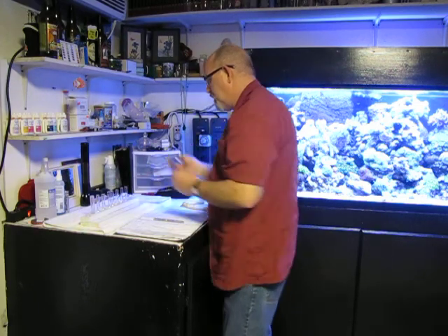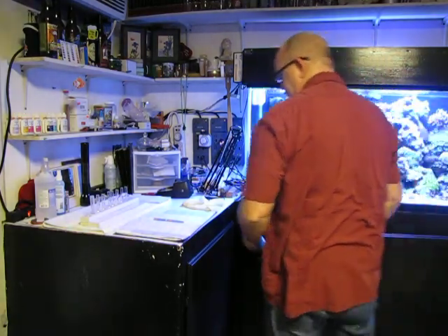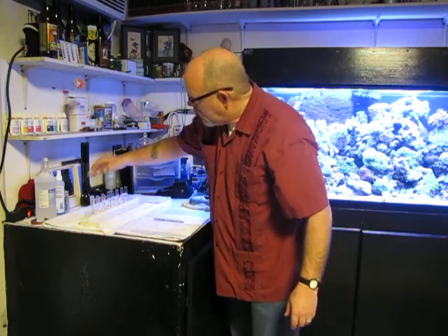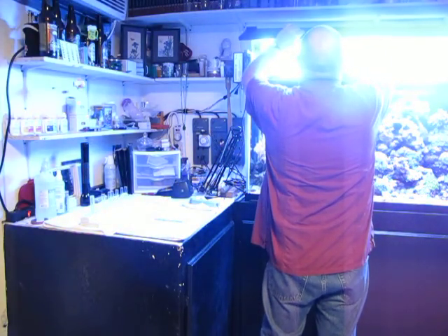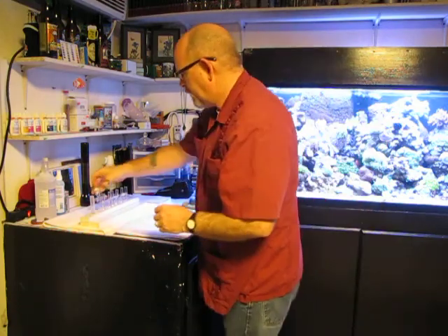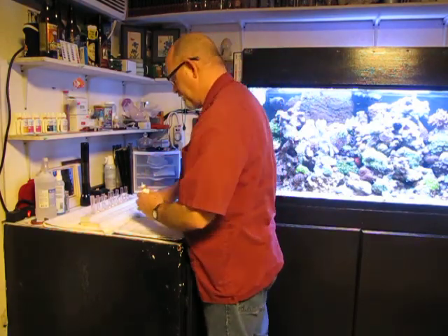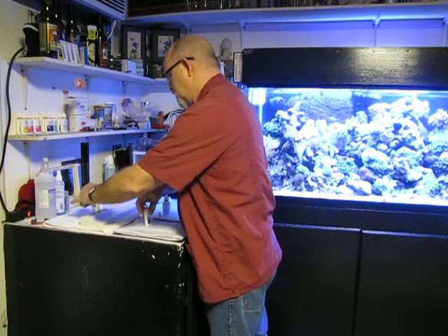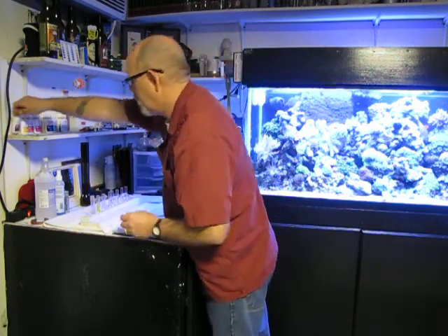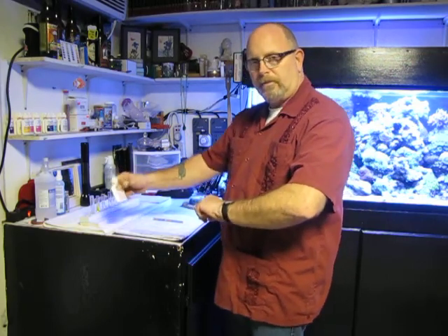Now we have them filled up to the five milliliter line. First one up is nitrate — ten drops of number one. Give it a little shake. This needs to be shaken for approximately 30 seconds.